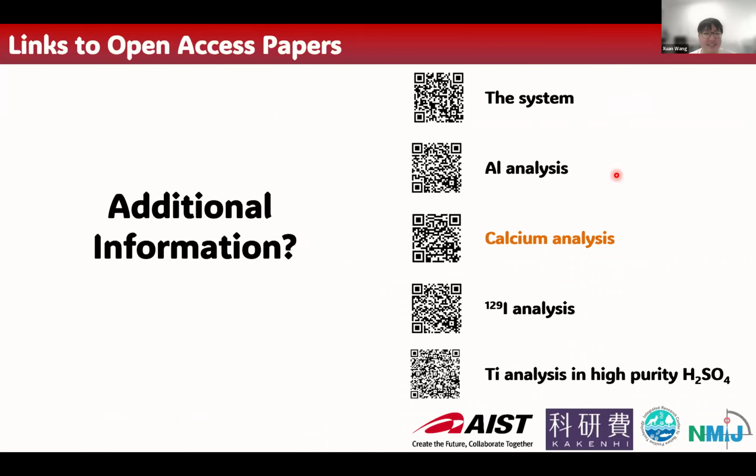Hi there. I noticed that you are very professional in analyzing with ICP-MS. For our experiments, because I'm in materials science research, I only use ICP to determine the detailed atomic ratio for materials such as cobalt, iron, and so on.